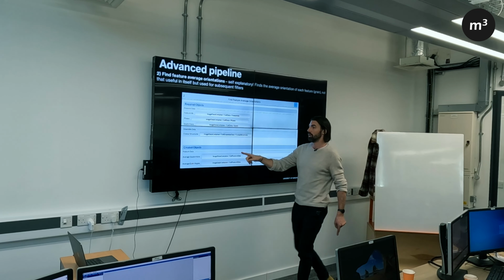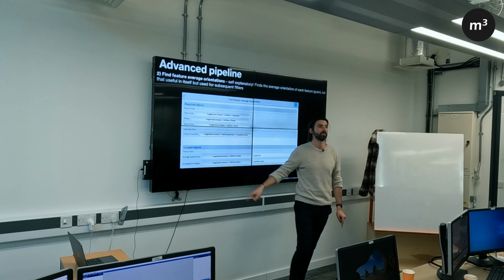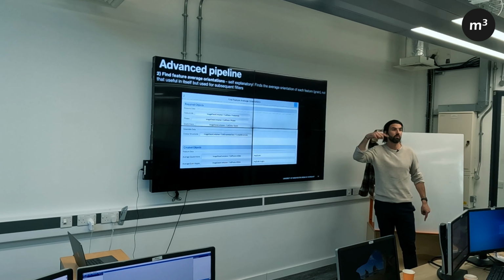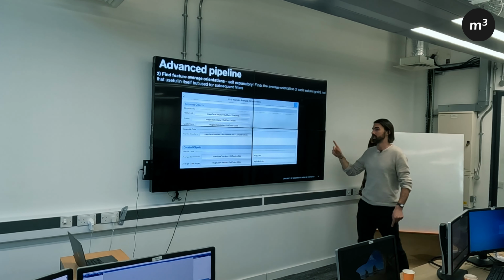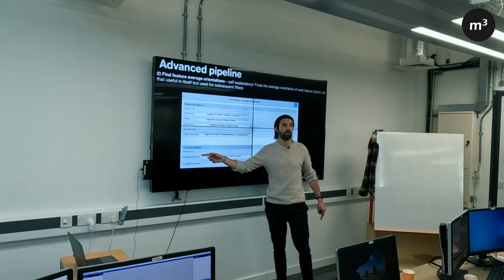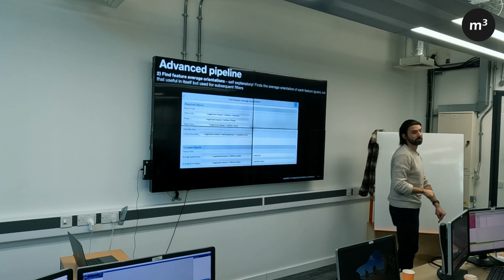So you'll see it here. On the feature level, we get average quaternions and average Euler angles for each feature. Again, not that useful in itself, but this is useful for some subsequent filters we're doing. But now you'll see you're creating 2 new objects, which are, for each feature, your average orientation in both quaternions and Euler angles.